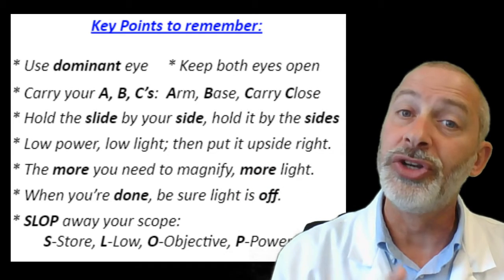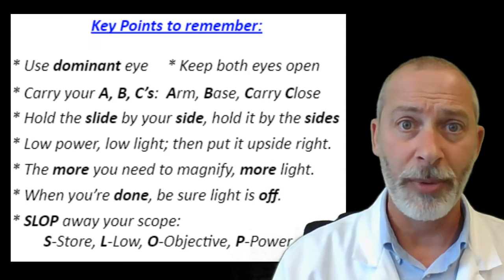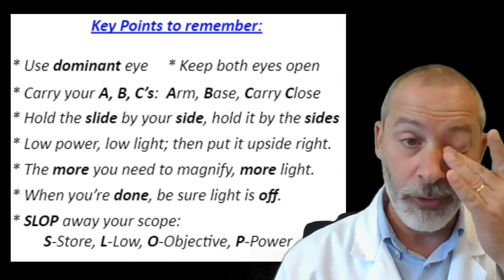That's why you're using your dominant eye to look through the microscope. And it may take several times before you get the feel for it.